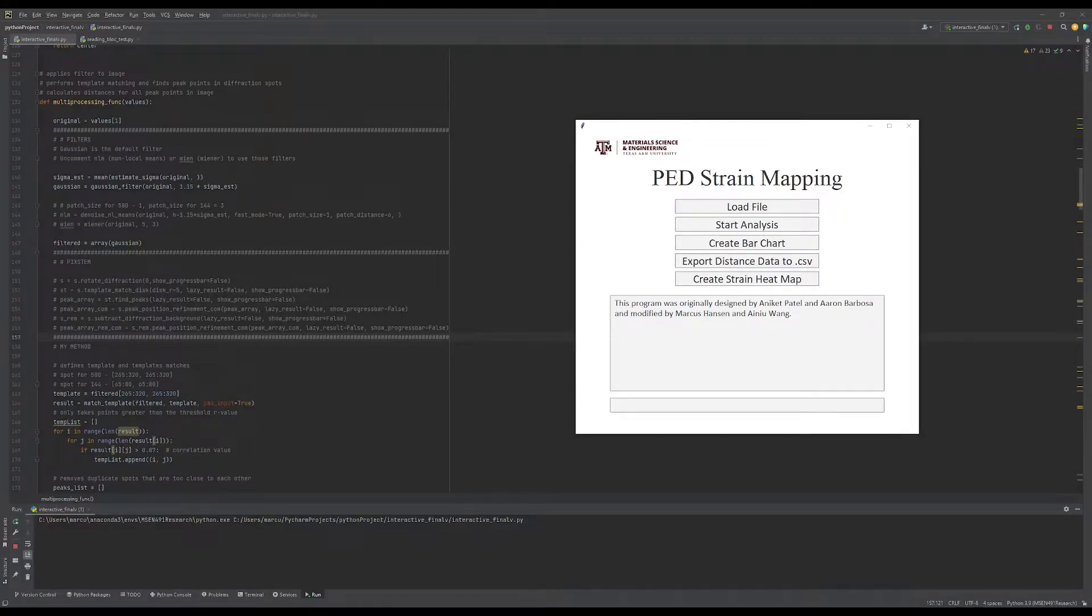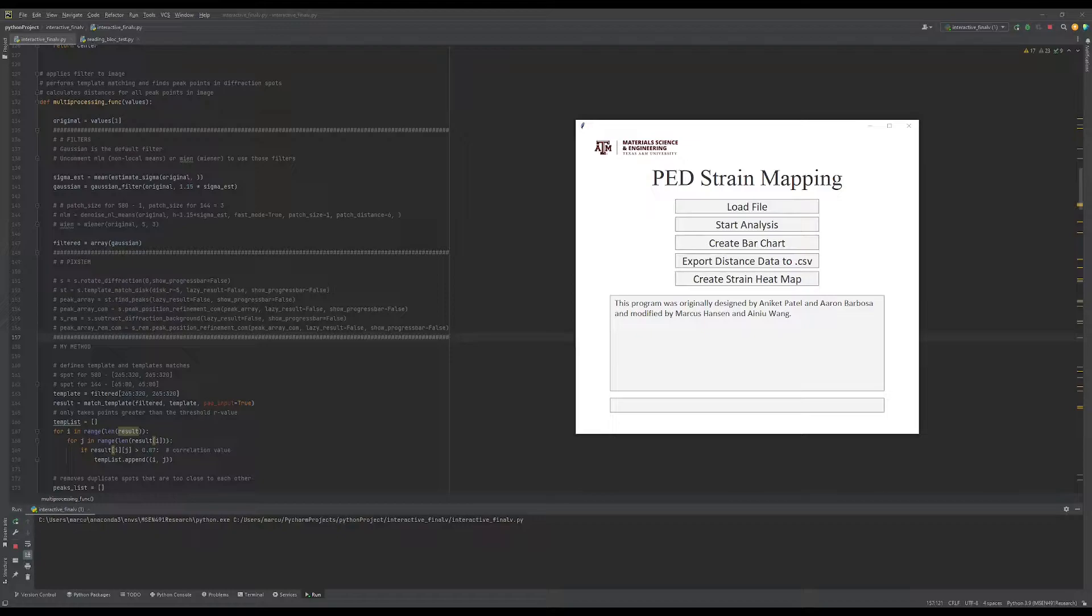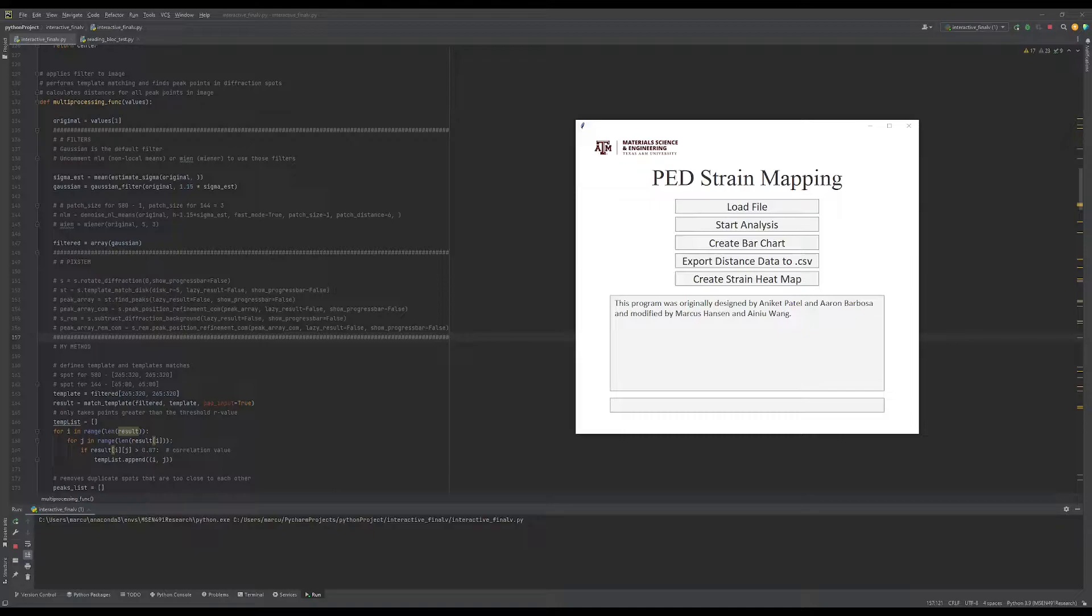Howdy, my name is Marcus Hanson and I'm a third year material science and engineering undergraduate student at Texas A&M University. In this video, I'll show a short tutorial on using our precession electron diffraction strain mapping program.